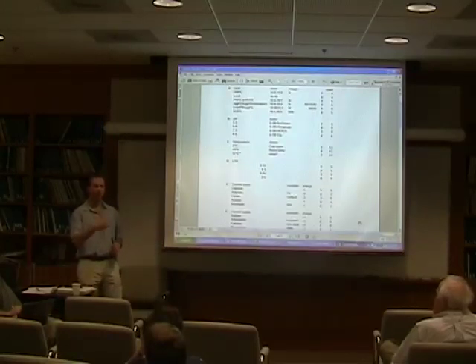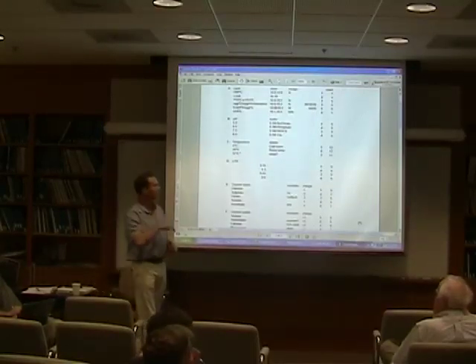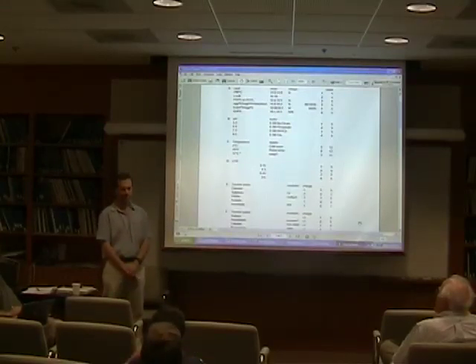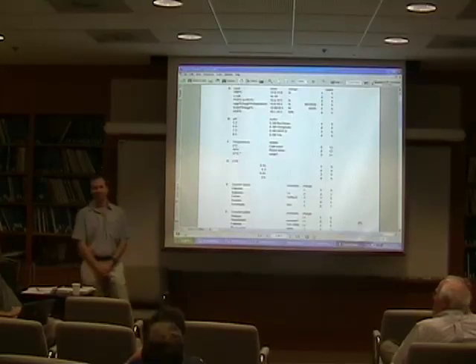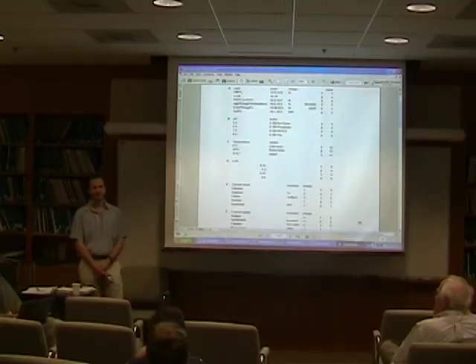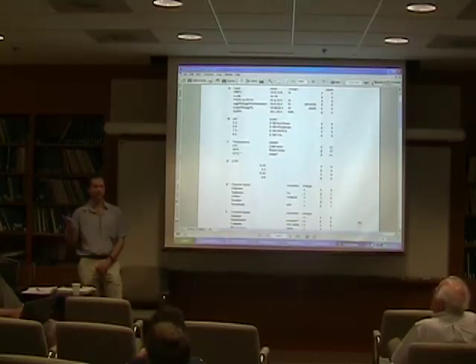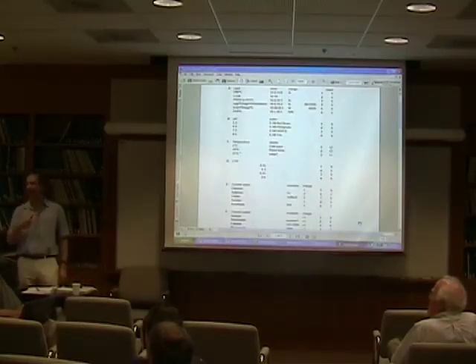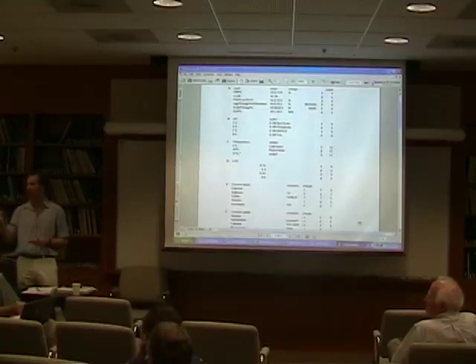The LPRs very much depend also on how you estimate protein concentration. Some people use the A280 value, or they use Bradford, or BCA, Lowry, whatever is on the market. So perhaps it's better for us to have a wider range, because it can really make a big difference. So the comment was just that the LPR that we use depends very much on the method you choose to determine the protein concentration, and therefore maybe we should have a wider LPR.